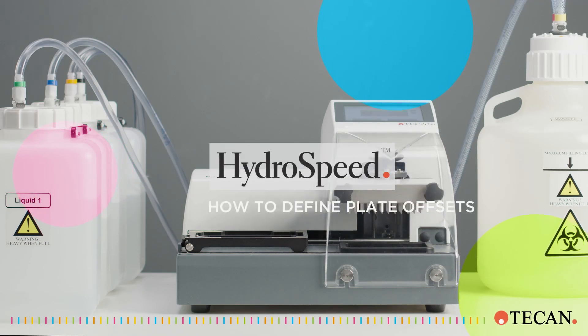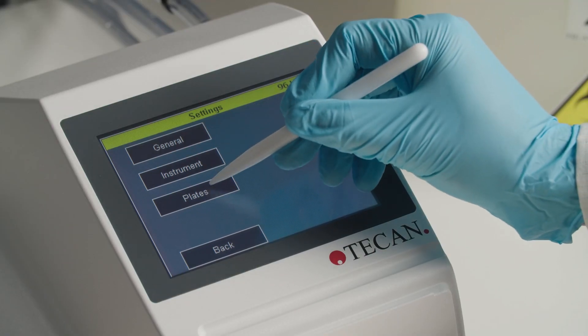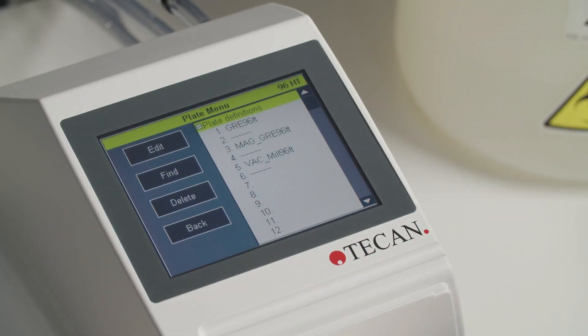Hi and welcome to this video tutorial on how to optimize plate offsets for the HydroSpeed microplate washer using the locally stored predefined plate library.